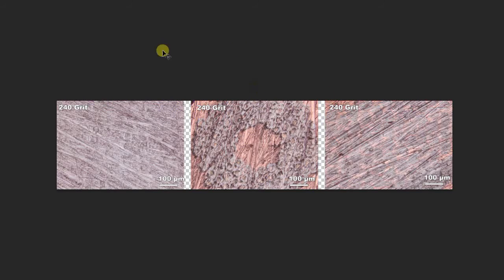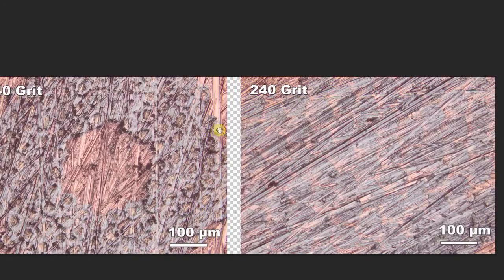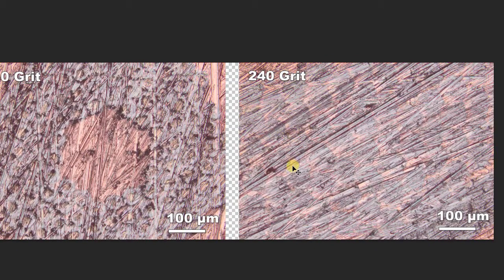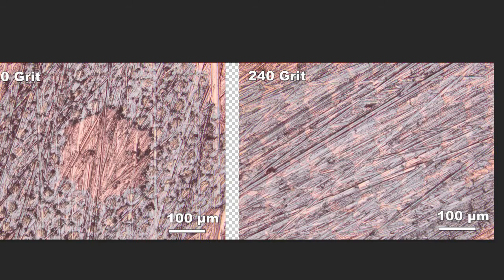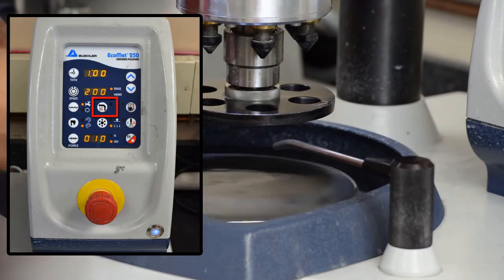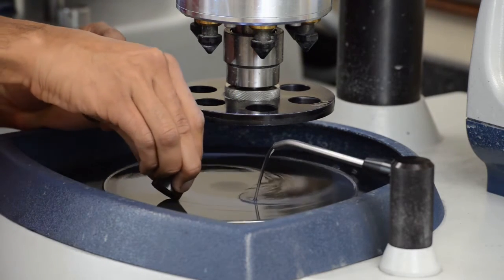Alright, so I've just done three samples with three runs of 240 grit. As you can see, I've labeled them — this is the aluminum block, this is your thin wires, and this is the thicker ones. You can see the scratches are very deep, there's somewhat of a structure underneath, but of course this wasn't going to be enough. We're just getting ready — we're getting these deep scratches and we'll delete them or get over them through higher grit paper. Now, one last thing before jumping into the finer grits: I'll make the edges a little smoother. Just grab it with your hand and put it on the sandpaper and go around like this.